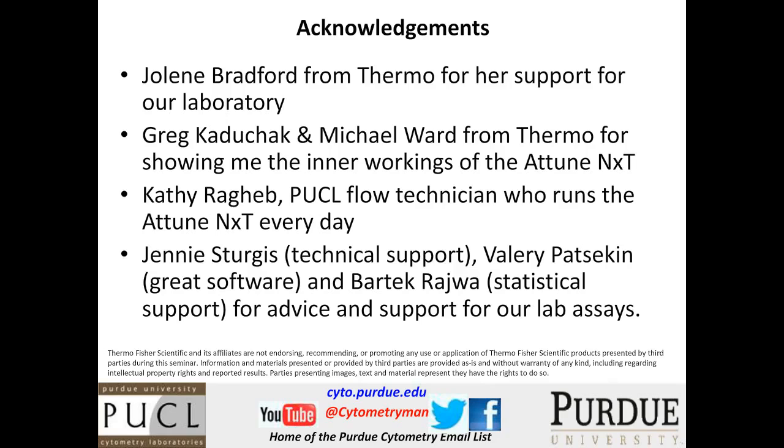Can you clarify that the Attune NxT has both acoustic focusing and hydrodynamic focusing, and why are they both needed? Well, as I said before, the original concept that Greg had was that you really didn't need anything else. You didn't need hydrodynamic focusing, because you could actually go with a sheath-less system. But as he found out when he designed and built the instrument, it works better.